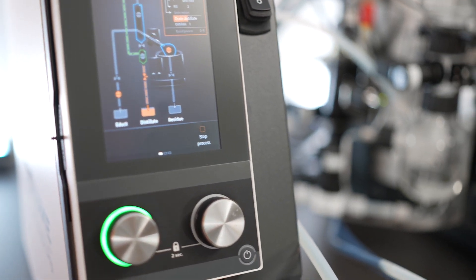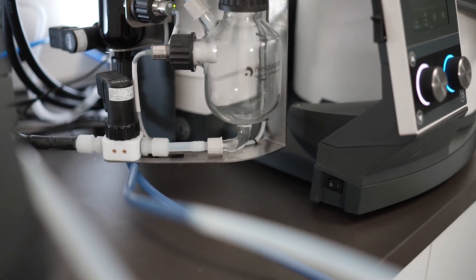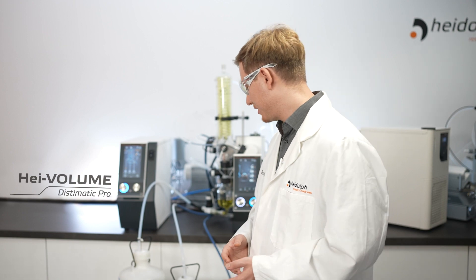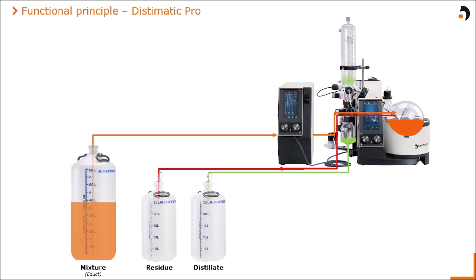As soon as the vessel is completely filled, the Distymatic Pro separates the vessel from the rest of the system. The evaporation itself is not interrupted, but the system aerates the vessel and afterwards increases the pressure inside only this component to push the collected solvent out into a collection vessel or can. For most applications the amount of solvent is significantly higher than the amount of residue, so this step will be repeated several times.